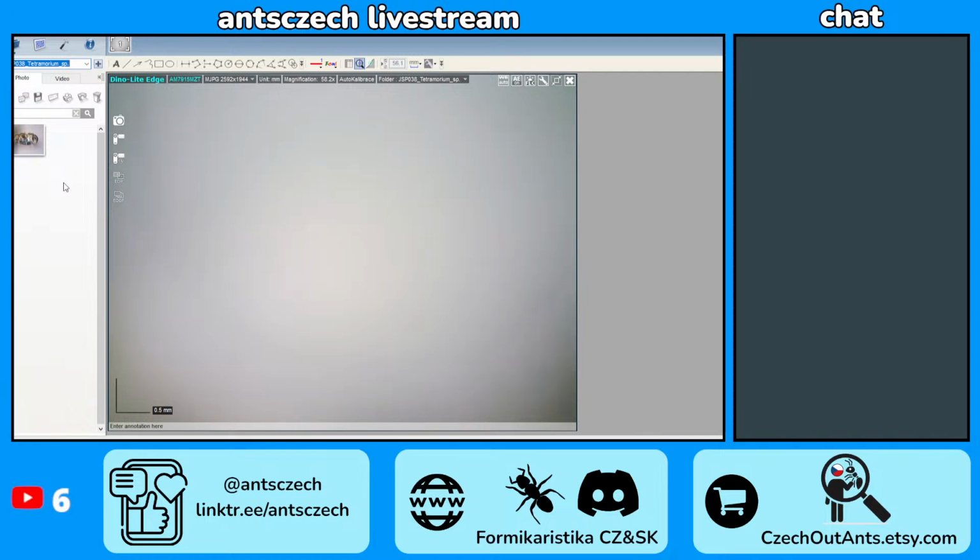Yeah, this is like the third digital microscope I have worked with, or maybe fifth. No, maybe I think. How many? 1, 2, 3, 3? I think 3. I'm not sure. And one of them I have at home.